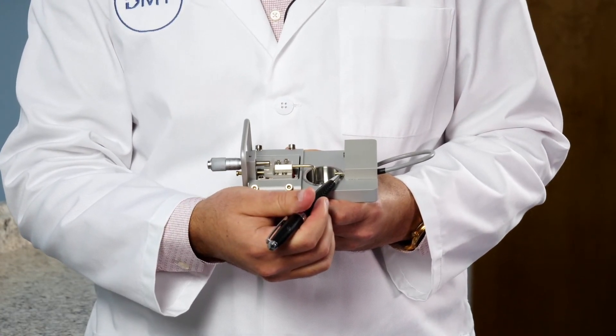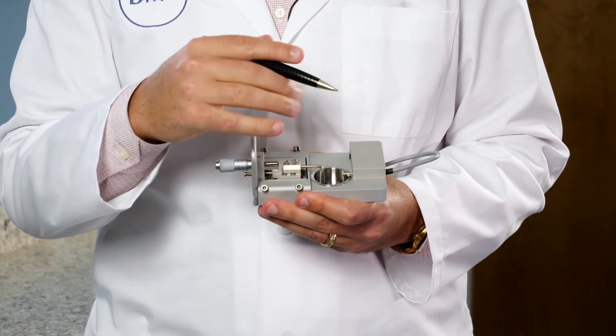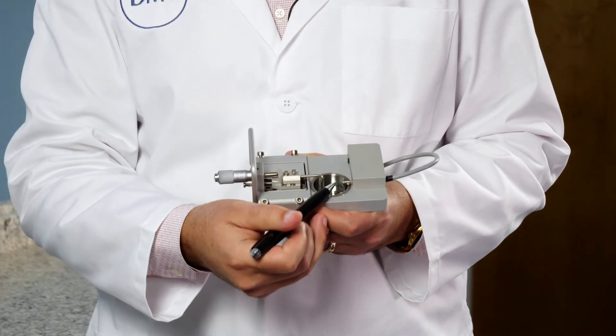If you loosen the back screw on the transducer side, that arm will swing back and forth. And all you really want is this side to be flat in the chamber.